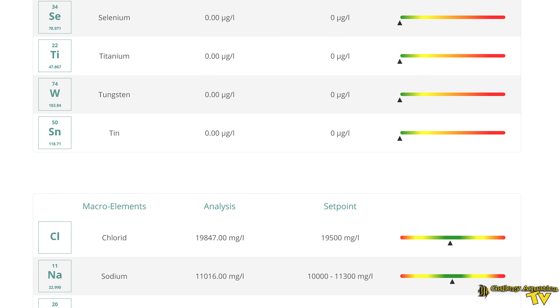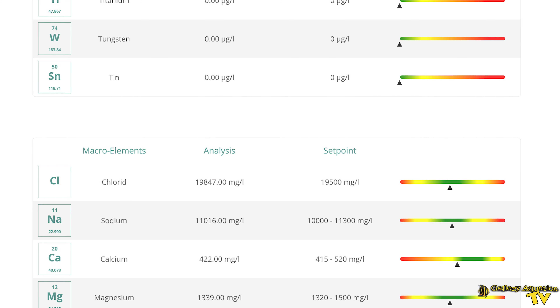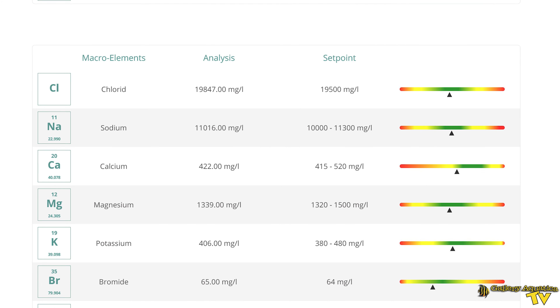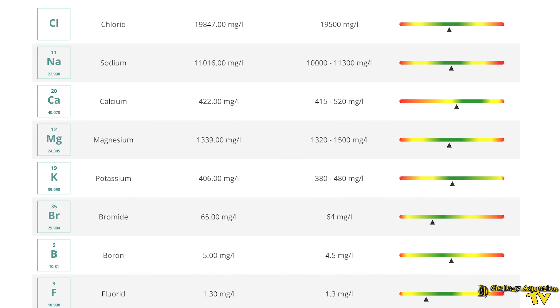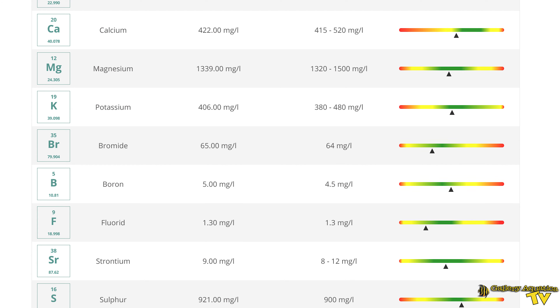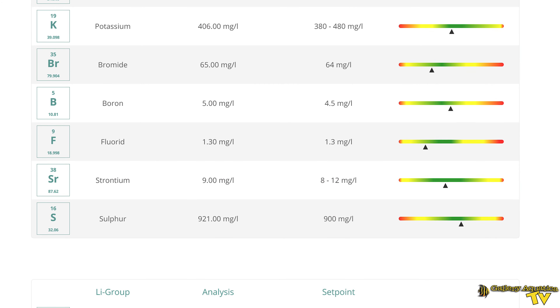Tin is another one that can be a contaminant in certain water, but we've got a very good analysis of zero. Calcium is one of the elements we often test with hobby grade test kits — our natural seawater calcium is 422, which is slightly on the low side but still within the green. Our magnesium has come in at 1,339, and we have a good ratio between the two — the ratio of calcium to magnesium is particularly important. Our potassium is coming in at 406, which is good; you don't want to have low potassium in your tank.